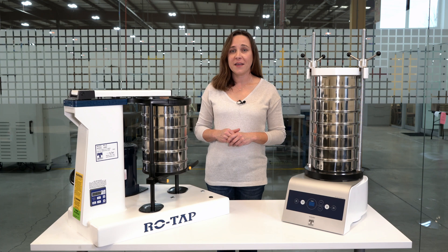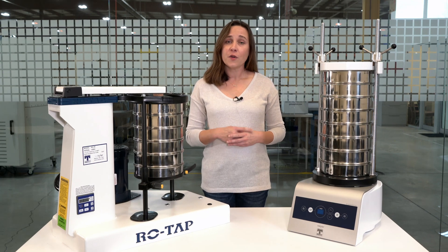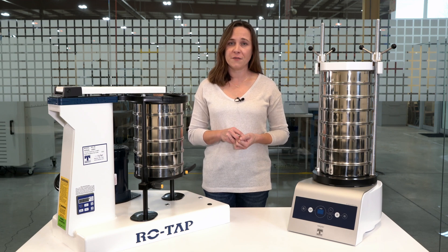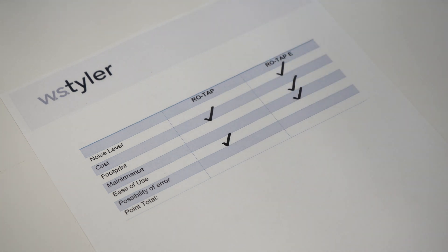The mechanical ROTAP is a plug-and-play type of shaker — it takes very little setup time to be ready to do your first particle analysis. The ROTAP-E premium, on the other hand, allows the user to customize the settings for the interval and the amplitude, and can take a little more time before you can do that first test. So in the category of ease of use, we're going to give the check mark to the mechanical shaker.